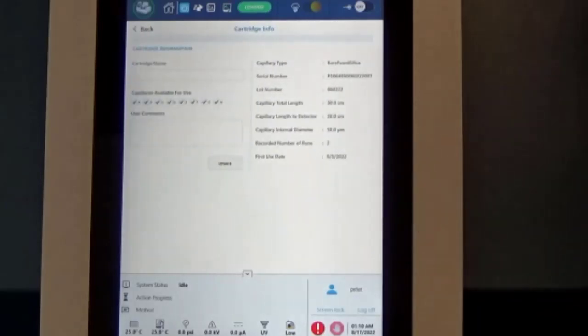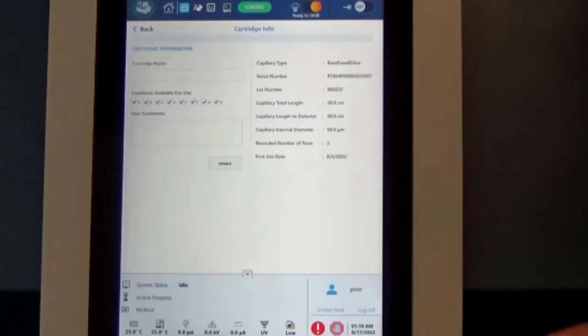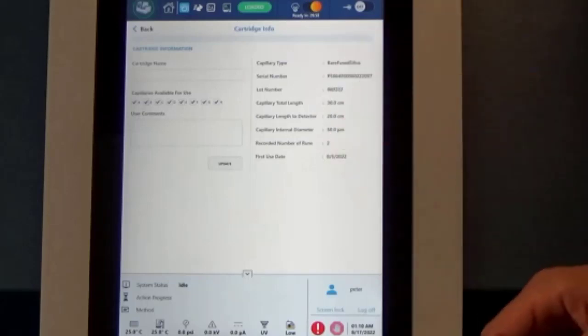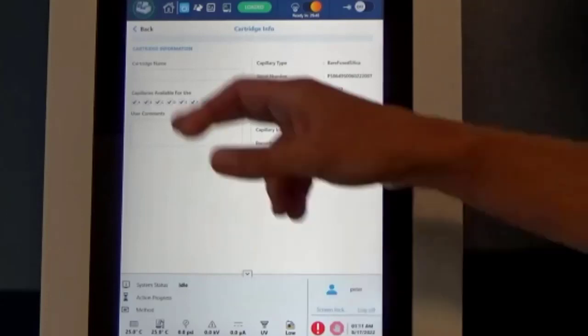Now, if we look at that cartridge info, we can get an idea of what we see there. The BioPhase 8800 cartridges do have an RFID chip that contains the serial number, lot number of the cartridge, capillary length, type of capillary, and number of runs that it's been used, the first time you use it. So everything is really captured on the cartridge at all times. There's no more paper logbooks that you need to be working with.